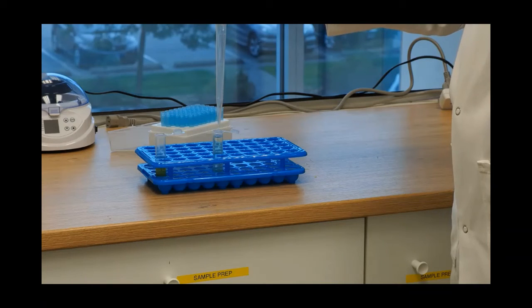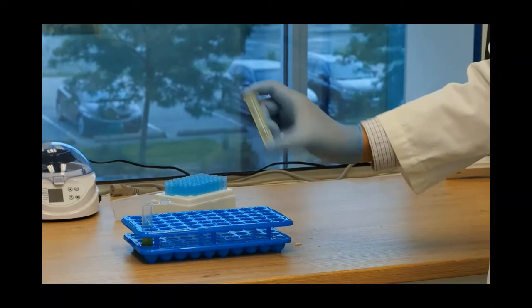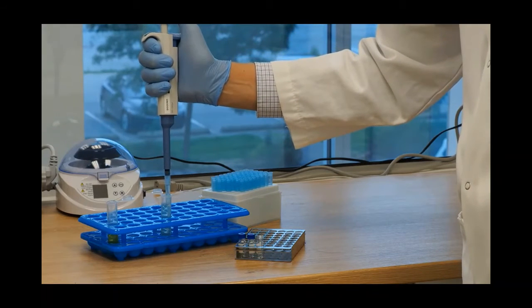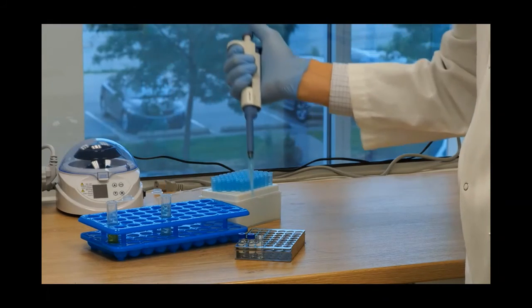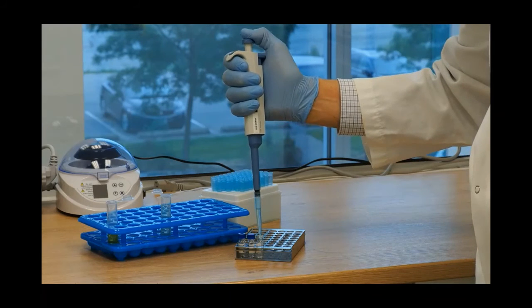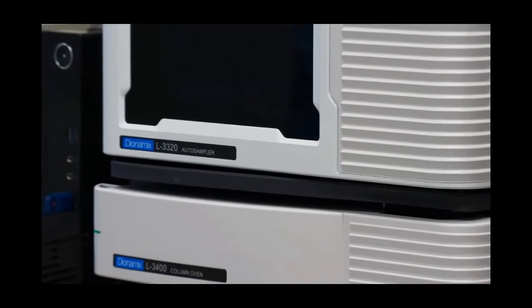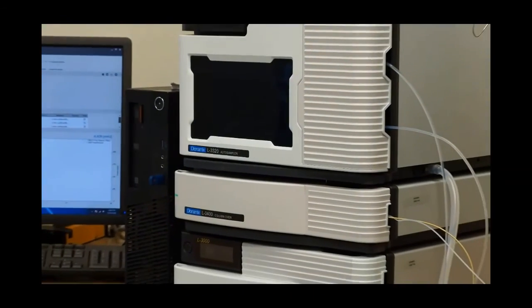Normally, you would test multiple samples across the batch to get a broad picture representation of the entire batch. Here we are taking only a sample along with a calibration reference and inserting it into the instrument for analysis.